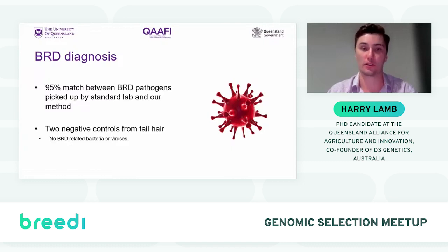In this, we also included 2 negative control samples, and these were tail hair samples. We wanted to include these because we wanted to check that we weren't just picking up any random viruses or bacteria, and that we were in fact not going to give back false positives. And for neither of these 2 samples did we detect any bovine respiratory disease related pathogens.